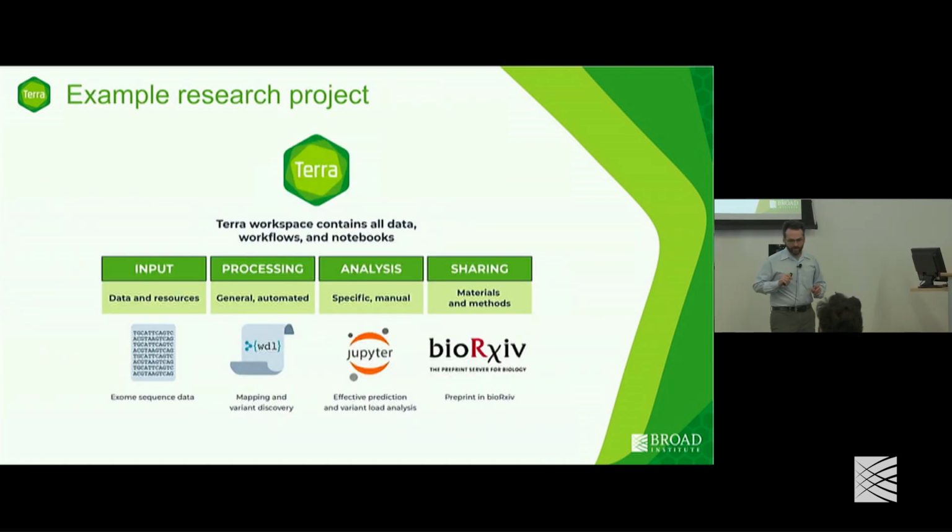So in order to understand this concept of a Jupyter Notebook existing inside of a Terra workspace, we should start by looking at an example of what's contained inside of a Terra workspace. And in many ways, one of the central principles that we're trying to convey to everyone in these Terra workshops is what a workspace is. A workspace in Terra you should think of as basically a digital laboratory.